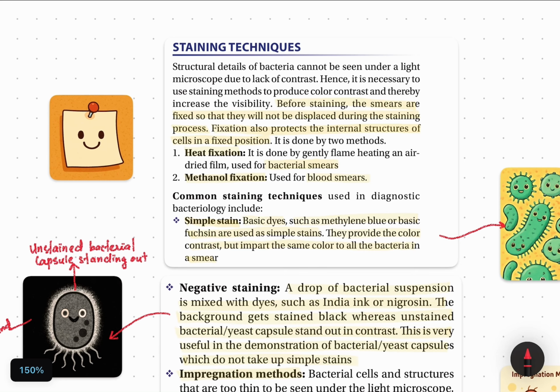Before staining, imagine you are going for your exam, you bring your exam board or notice board, you put a paper and then you put a paper pin on that, right? So this is why it has to stay in that place. Similarly, before we are staining, the smear is fixed on the slide.